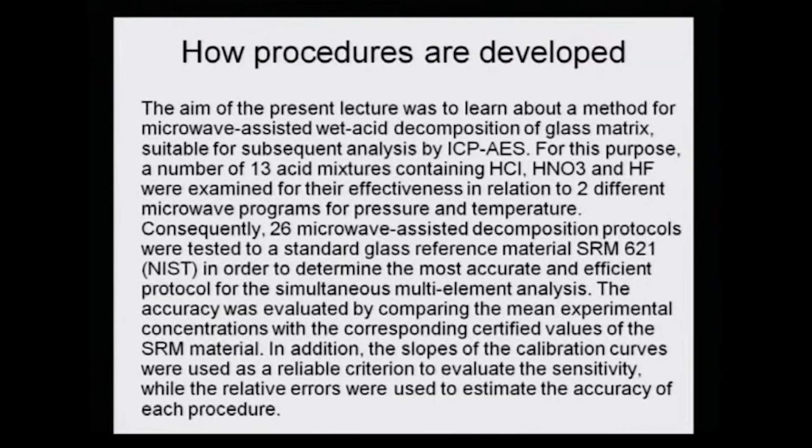So, the whole method was developed. It was a calibration method which was then used for the new samples, whether it is an archaeological sample or a modern glass sample, all compared with the reference sample SRM 621.